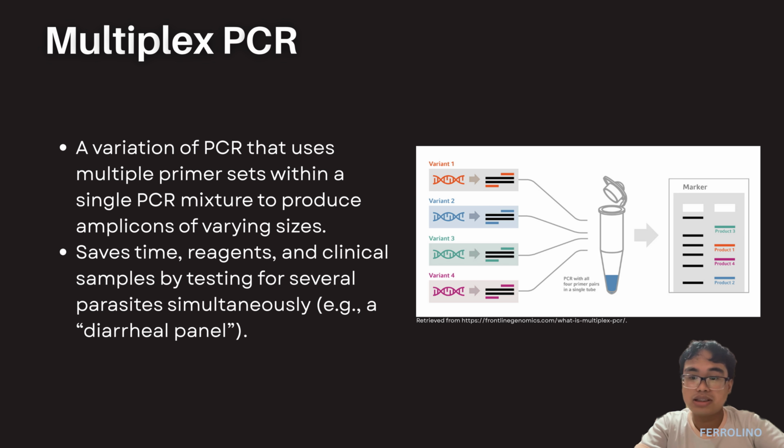Next, primers must be checked via bioinformatics to ensure they do not form primer dimers with each other. In a multiplex tube, the concentration of oligonucleotides is high. If any two primers are complementary, they will then amplify each other rather than the parasite DNA, leading to false negatives. And lastly, in real-time multiplex PCR, each target is tagged with a different fluorescent reporter.